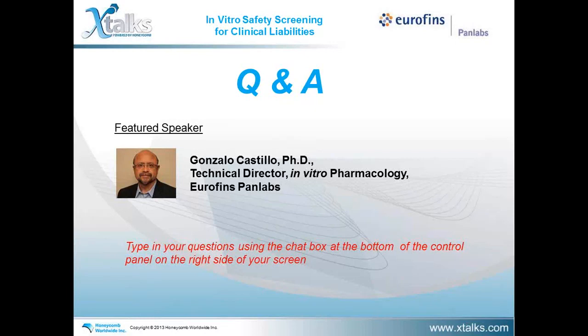Right. Okay. Thank you. Our next question here: why use binding assays instead of agonist or antagonist determinations as the initial screen? Your thoughts there? Yes, there's many advantages of using binding assays. The first one is binding assays allow you for the determination of affinities, and this is important because you can use that information for SAR, and it's very difficult to use that type of information from, let's say, a cell-based assay in which you're going to obtain agonist and antagonist information.